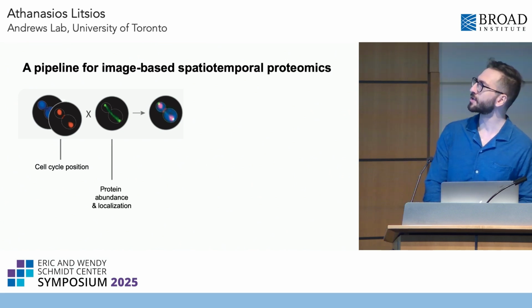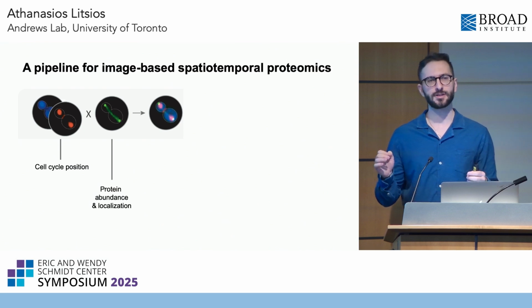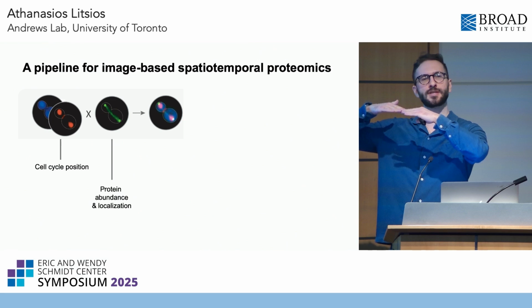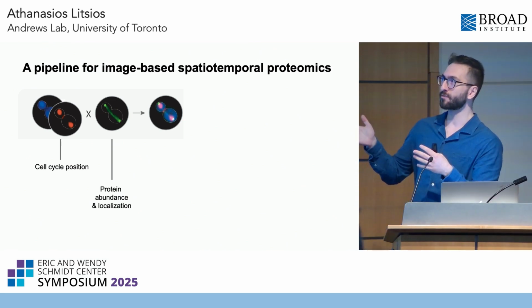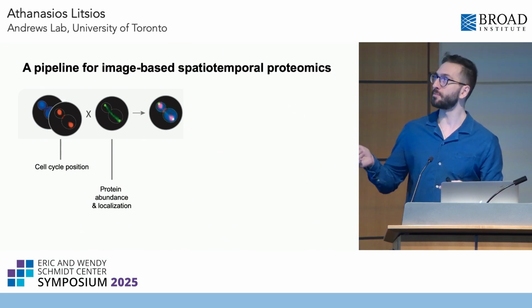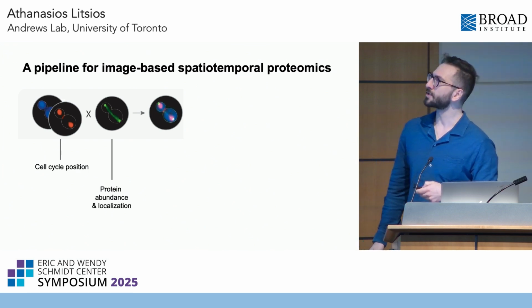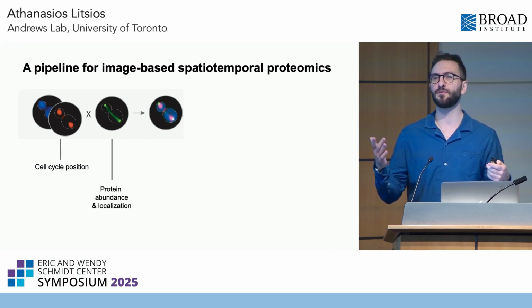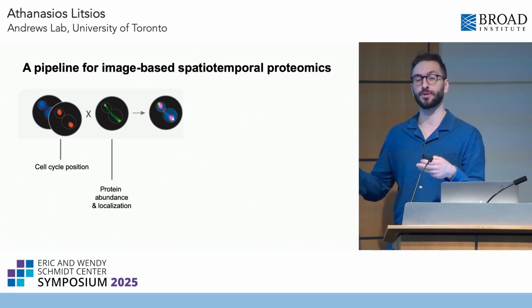And then we made use of the so-called yeast GFP collection. This is a collection of approximately 4,000 yeast strains, and in each of these strains, a different native protein is fused to a green fluorescent protein, or GFP. Via this fusion, if we inspect our cells with fluorescence microscopy, we can measure the abundance of the respective native protein, but also identify its localization in the cell. And I have to say that this collection of approximately 4,000 yeast strains spans approximately 75% of the yeast proteome and nearly 100% of the so-called visible yeast proteome.